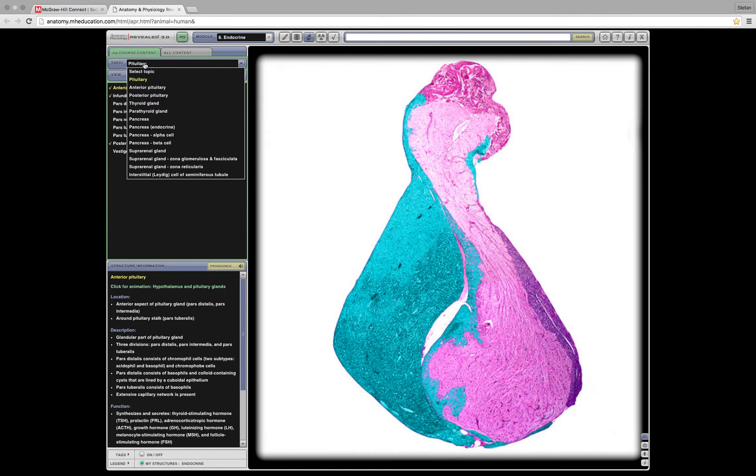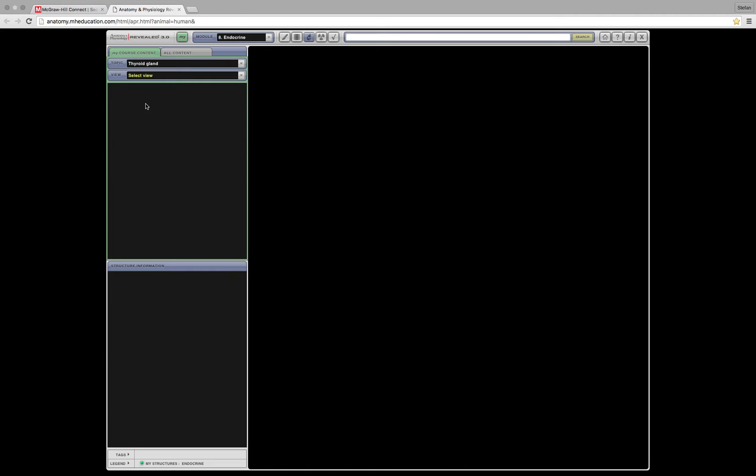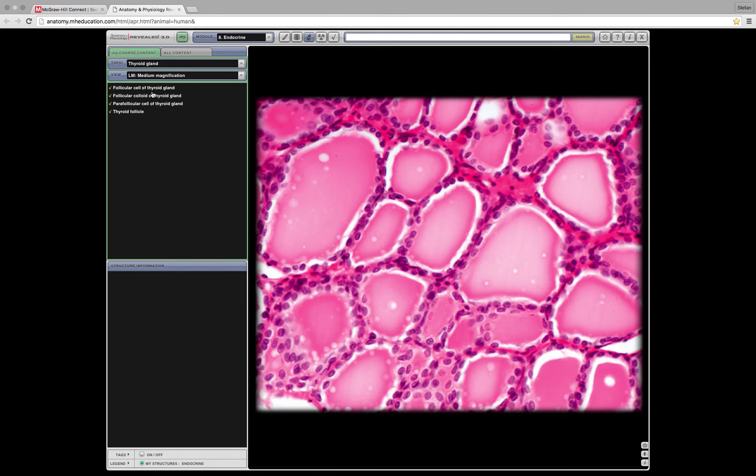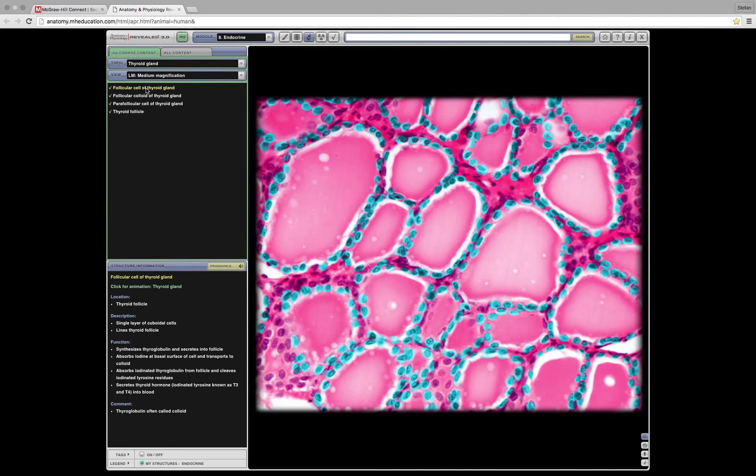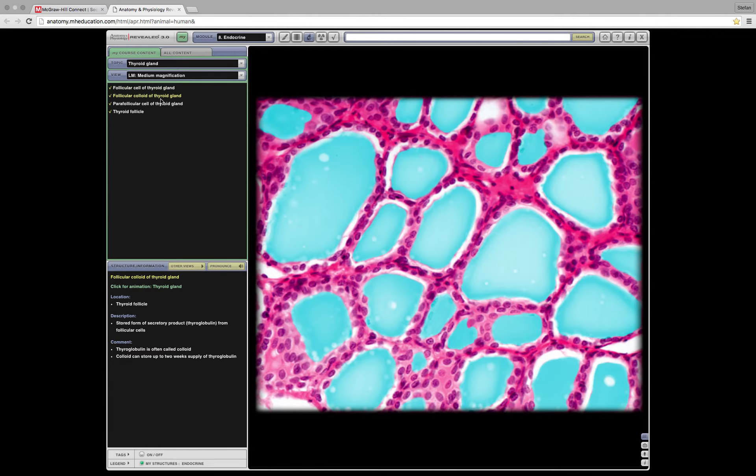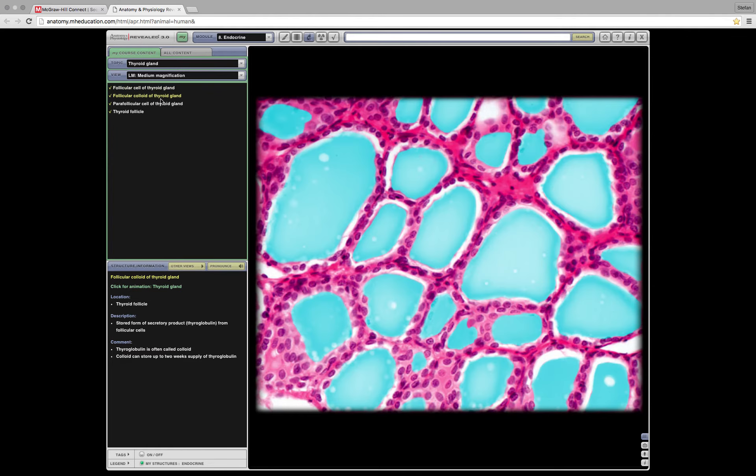Now let's move towards the thyroid gland. Medium magnification, is that enough? Yeah, that's perfect. You have to know the thyroid follicle cells and the parafollicular cells. So this is what a follicular cell looks like. As you can see there, the cells on the perimeter, the colloid, that basically just means the liquid inside. That's all colloid means really.